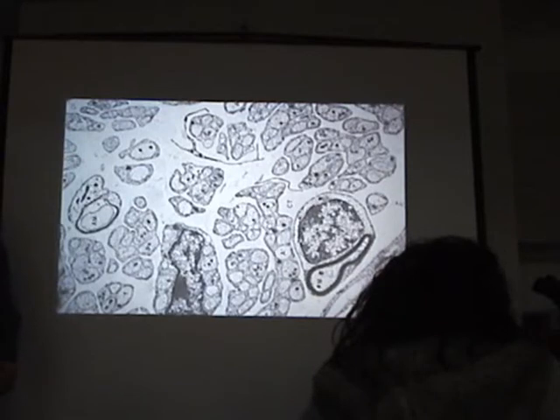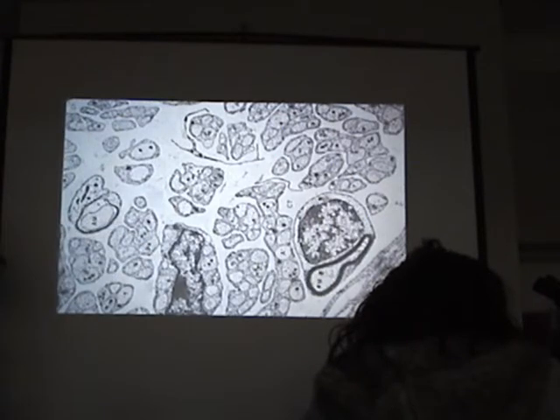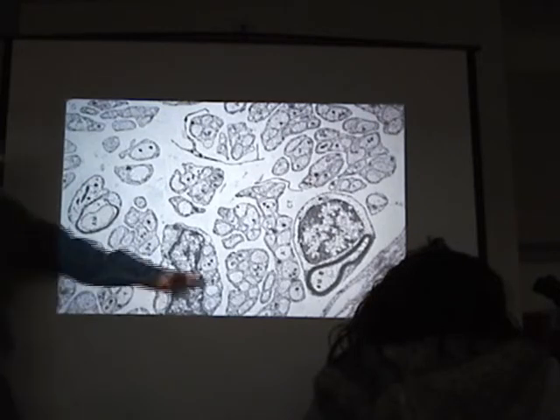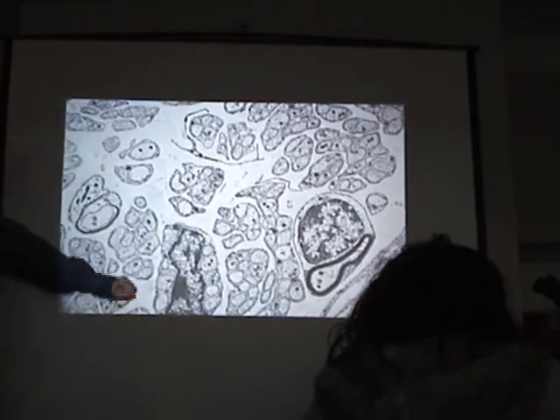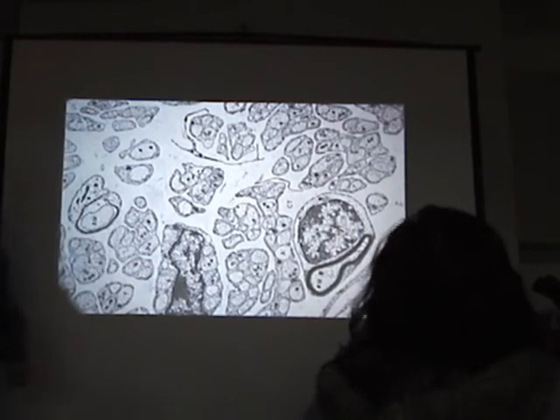Sarah? The one in the middle on... This one right here? Yeah, that's a Schwann cell or an... No, no, this is a peripheral nerve. You know, and again, I should have made that clear. I was following up from that peripheral nerve bundle. Oligos are found only in the brain and spinal cord white matter. All right? The myelinating cell of the peripheral nervous system is the Schwann cell. But it doesn't always myelinate. Hence, you can get unmyelinated fibers. All right?